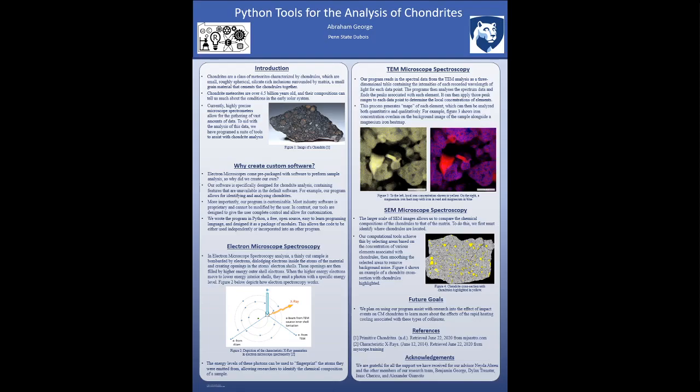These electrons fly into the atoms of the material and collide with electrons in the inner shell. This creates gaps inside the electron's lowest energy orbitals. These gaps are then filled by higher energy electrons falling from outer orbitals into these gaps in the inner orbitals. And whenever those electrons go from the high energy orbital into the low energy orbital, they emit an X-ray. We can then look at the X-rays, specifically the energies of these X-rays, and use that to fingerprint the chemical composition of the material emitting them.